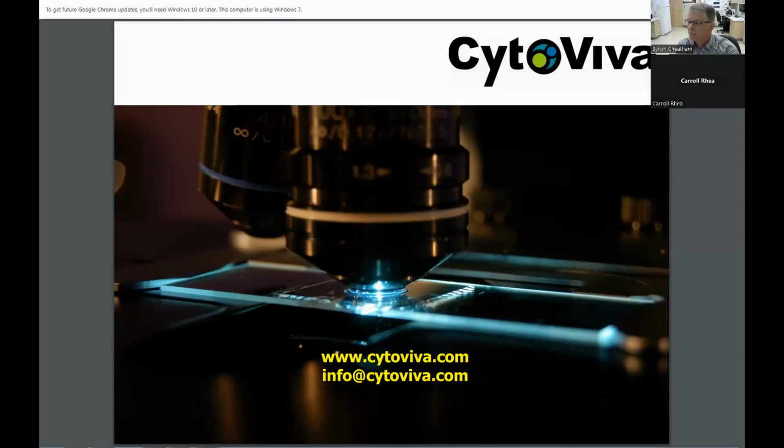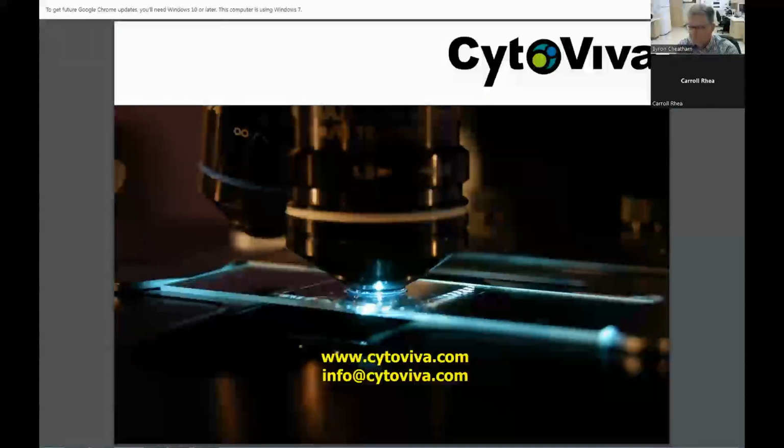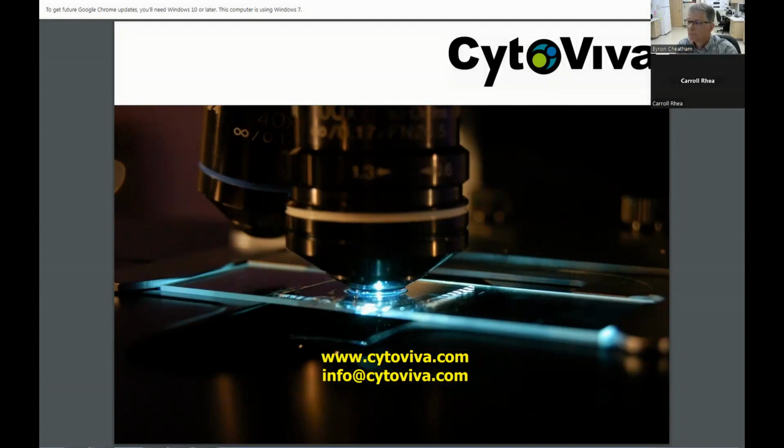All right, next, can the spectral profiles be predicted through analytical models, such as weak phase objects and Rayleigh scattering? It can. I've seen people do that math. I've even seen people take the optical spectrum of something and conduct the math to know what the wavelength number is for the Raman signal of that, for a known signal. So yes, there's a lot of analytical analysis you can do with that signal if you understand the math. I will admit that's above my capability, but I've seen some really smart customers that do similar work to that.